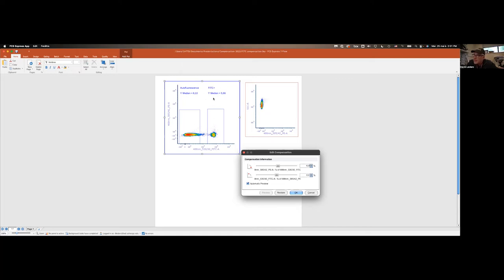If I guess 6.9%, now I have virtually the same values for the median of the negative and the median of the positive. There's a slight difference between the two. That's widely accepted. My artifact completely disappeared. So now we can say this compensation is done properly, and we can move on.